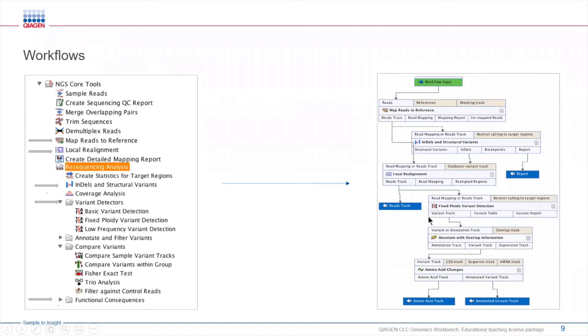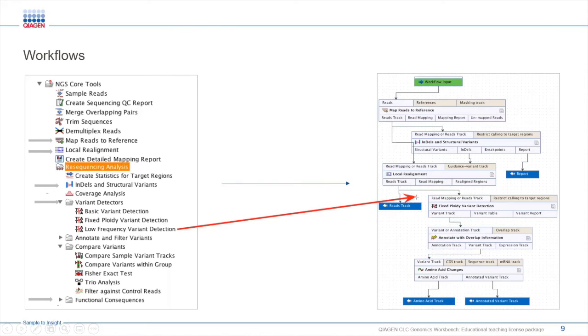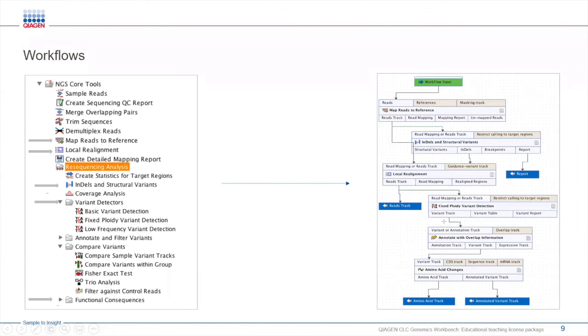For example, let's say that you want to do a different type of variant detection. You can simply go into the toolbox and let's say that you're interested in doing low frequency detection, drag the tool into the workflow, and then connect it to the corresponding tools to complete the workflow path. Once you make the changes, you can easily save them and use the workflow for future analysis.